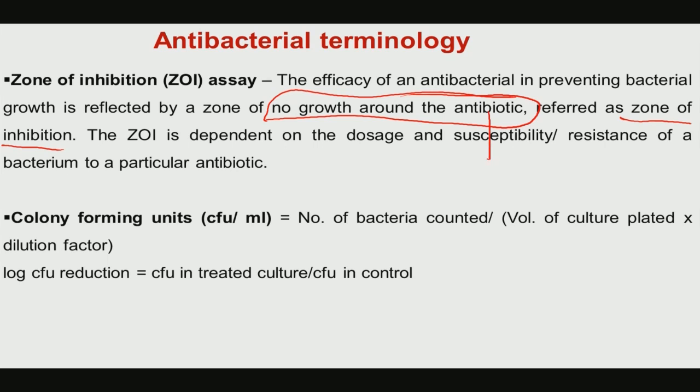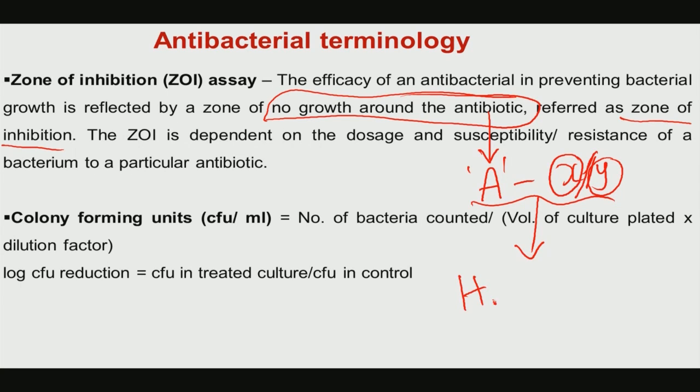Let us say there is an antibiotic drug A, and you want to understand what the dosage X or dosage Y is, which is the minimum inhibitory concentration, or which can be assessed for the ZOI or for the MBC. Now, in the context of an antibacterial material, let us say hydroxyapatite, and I have given this example multiple times, X% silver composites. Instead of an antibiotic, you are interested in what value of X% silver will give you a similar description for the MIC or MBC or ZOI.